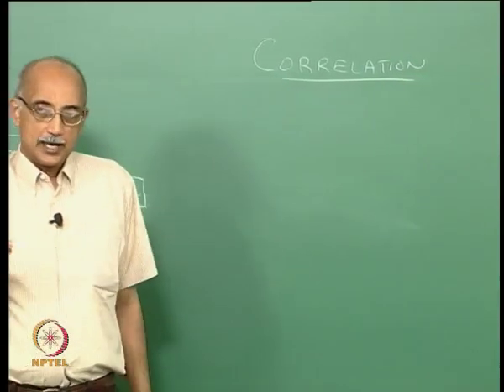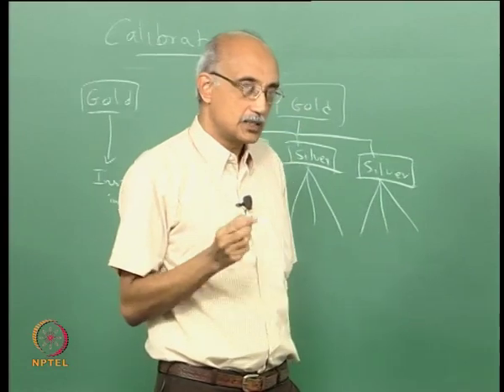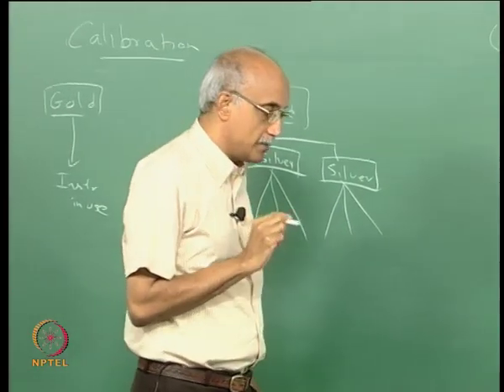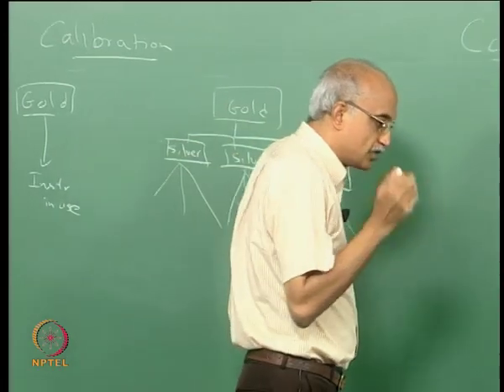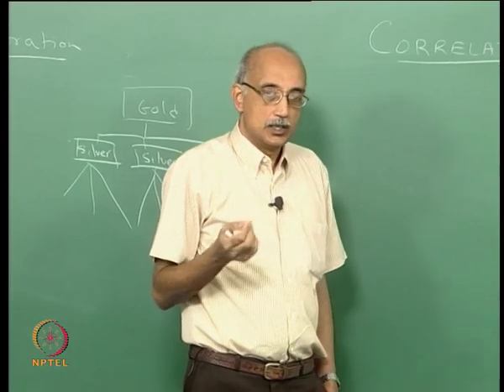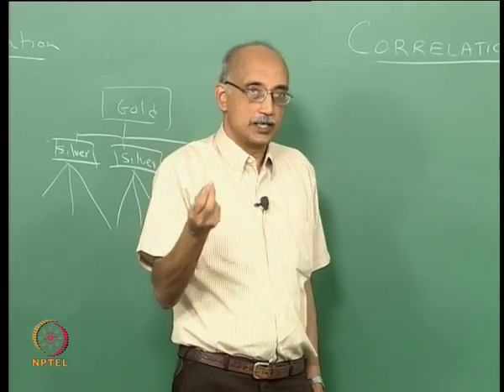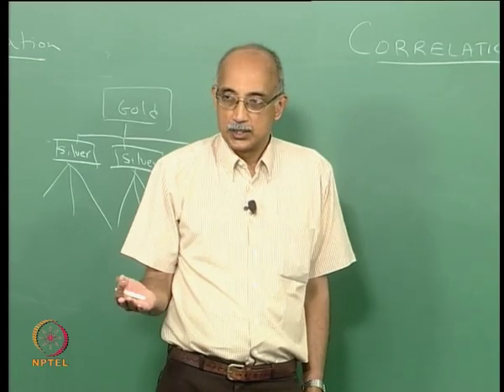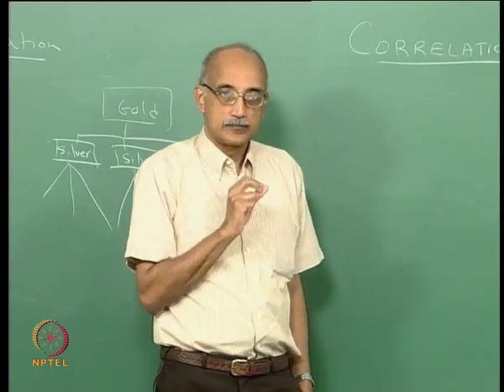The difference between calibration and correlation is very subtle but very important to understand. Calibration is really a measure of the instrument itself. For example, if you are using a laser based light scattering instrument, it is a measure of how stable is the laser. Is this laser starting to lose its life? Is it starting to drift? So, it is very equipment focused.